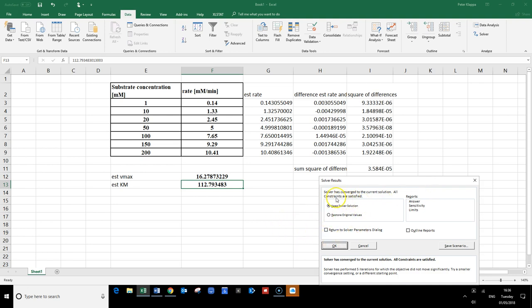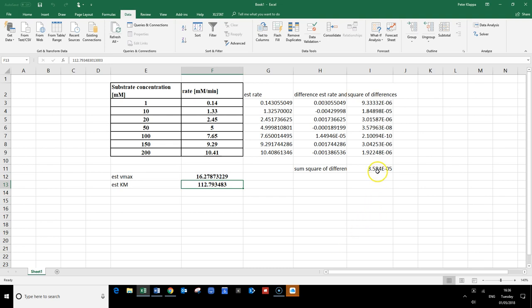Solver does find a solution to our problem — it optimizes our estimated Vmax and Km. It gives us the minimum sum of squared differences, which is a very small number. By changing Vmax and Km to these optimal values, we find that Vmax is 16.28 and Km is 112.79. With these two numbers, our calculated rate is as close as possible to the observed rate — any changes would result in a higher difference.